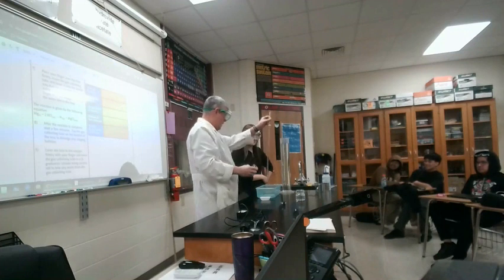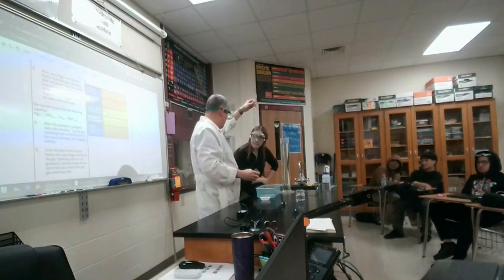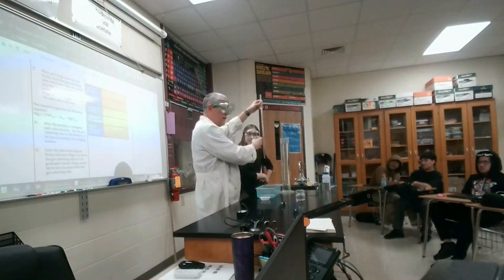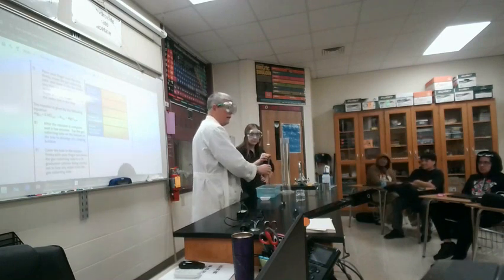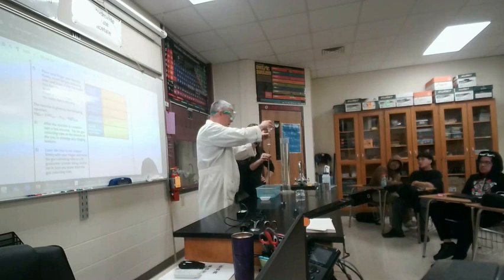Now, if I put in 20, what are we near there? More 19 than 20. That's close enough. You could also measure it on there. Can you hold that for me now? Now you take water out of your container and you finish filling this completely up. By completely, I mean as high as it will go, actually letting it overflow at the top.